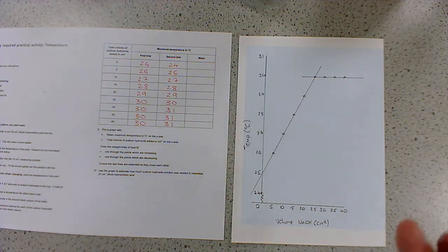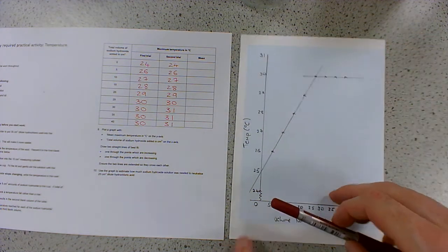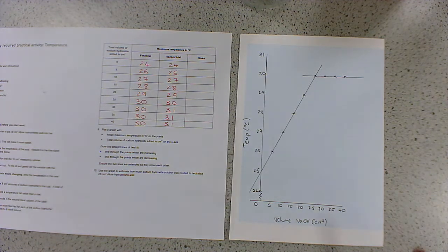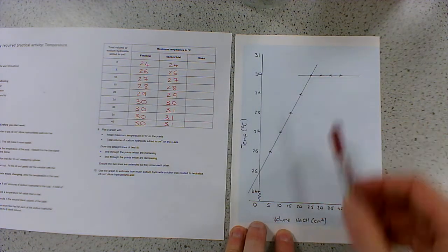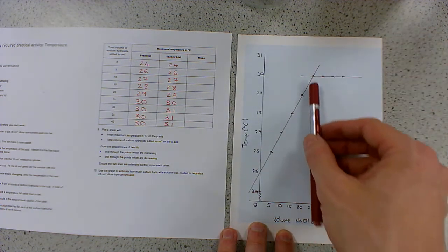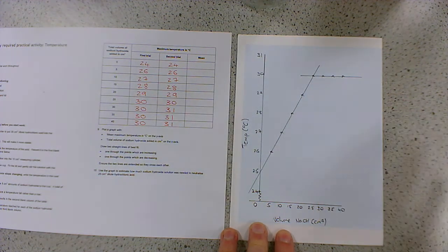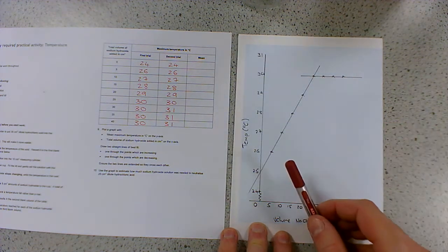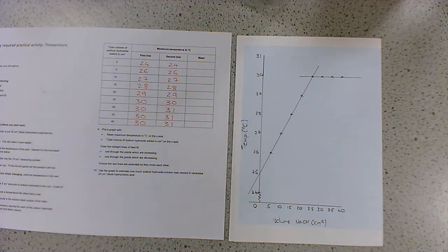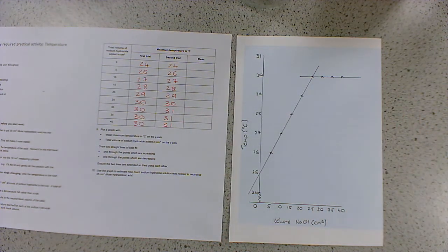So what we can now tell from this, so this is where the two lines of best fit come from, because you've clearly got two trends. You've got the increasing temperature of when we're adding our sodium hydroxide, and then suddenly, it stops moving. So this isn't one trend, okay? This is two trends. This is the increasing temperature, and then after the reaction's finished, because clearly what's happened here is the reaction has just stopped, and that's why the temperature has stopped increasing. If we did this for long enough, what we'd actually see is this started to decrease. It would start to cool back down.